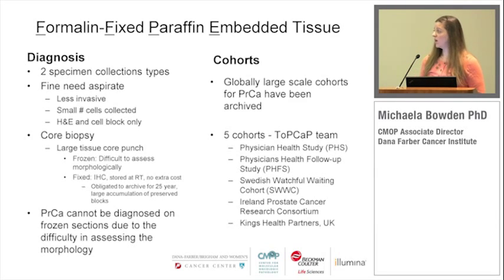It's not only one. And it's always fixed, so that's always fixed for immunohistochemistry work, for anything that they may want to look at targets on that particular specimen.